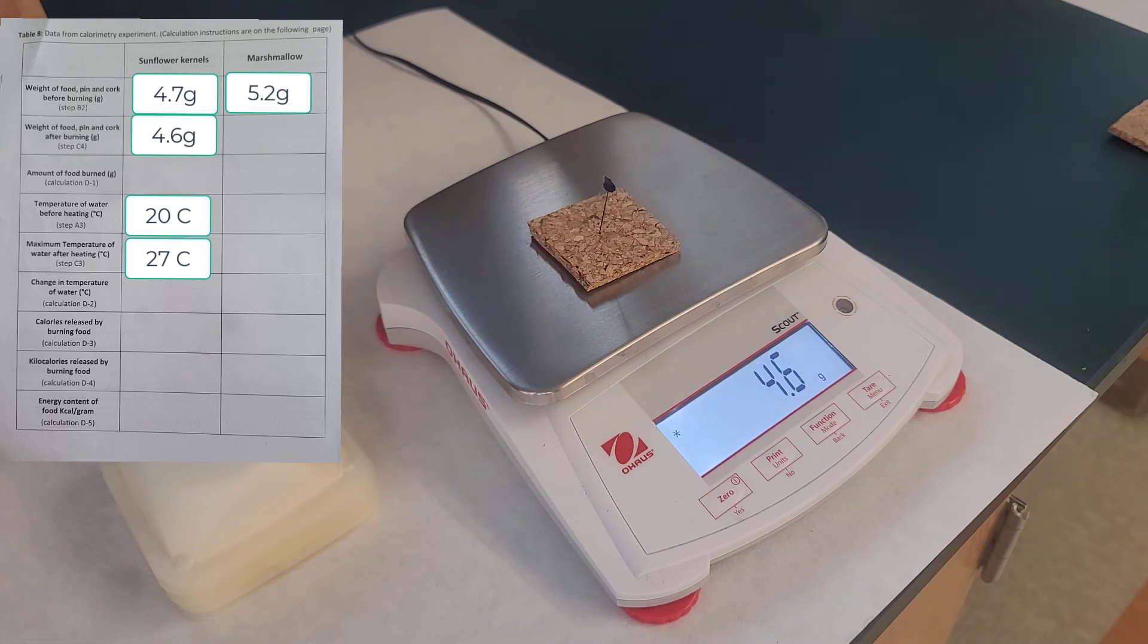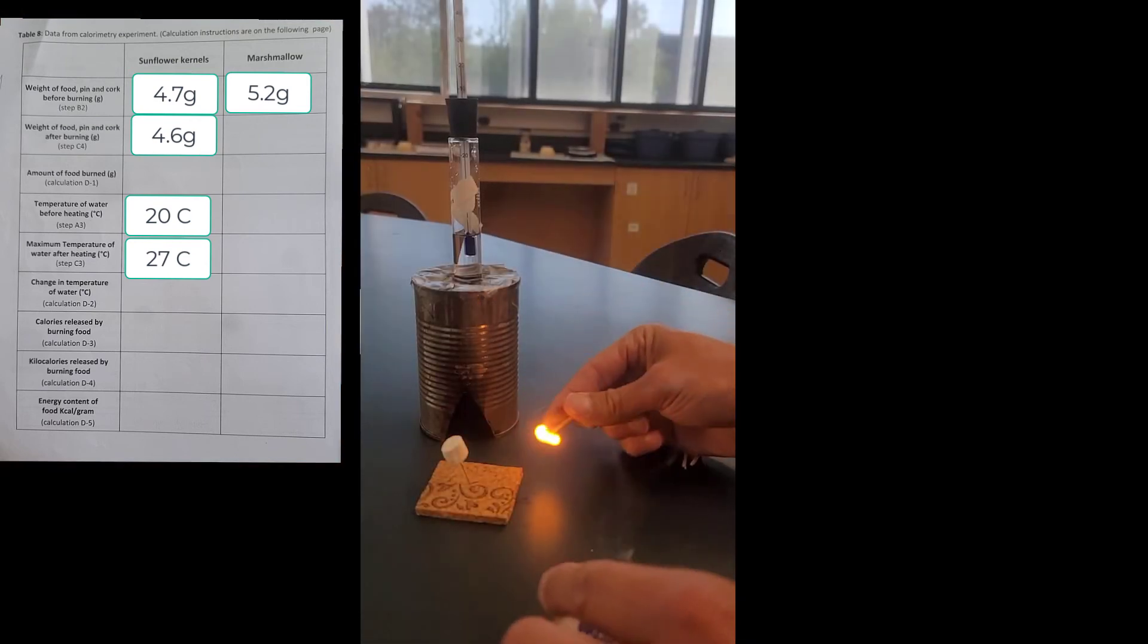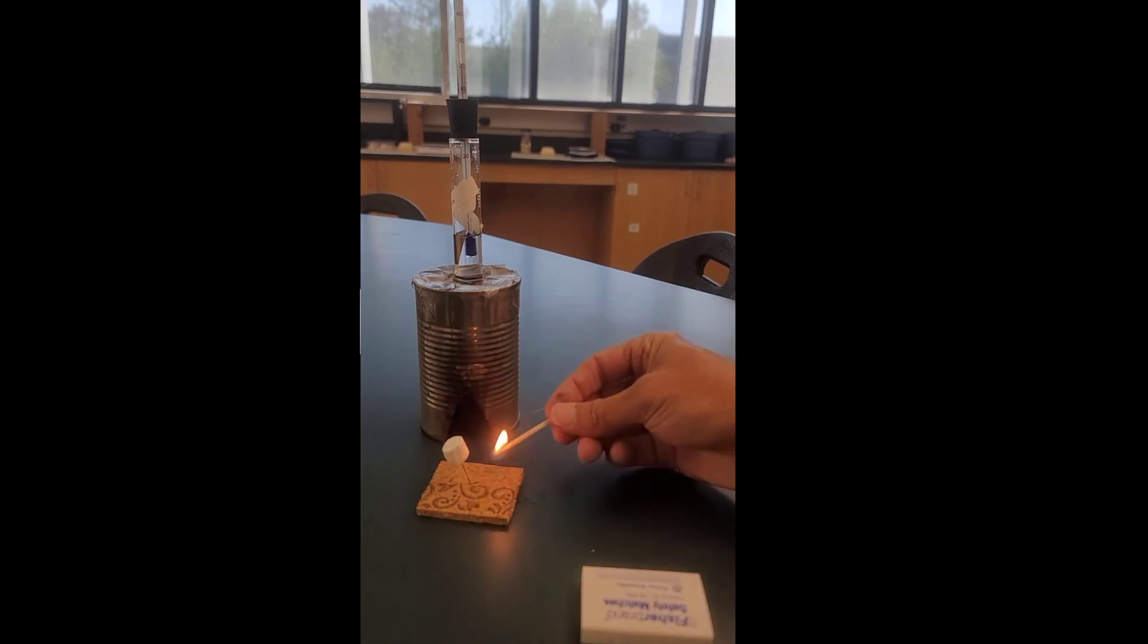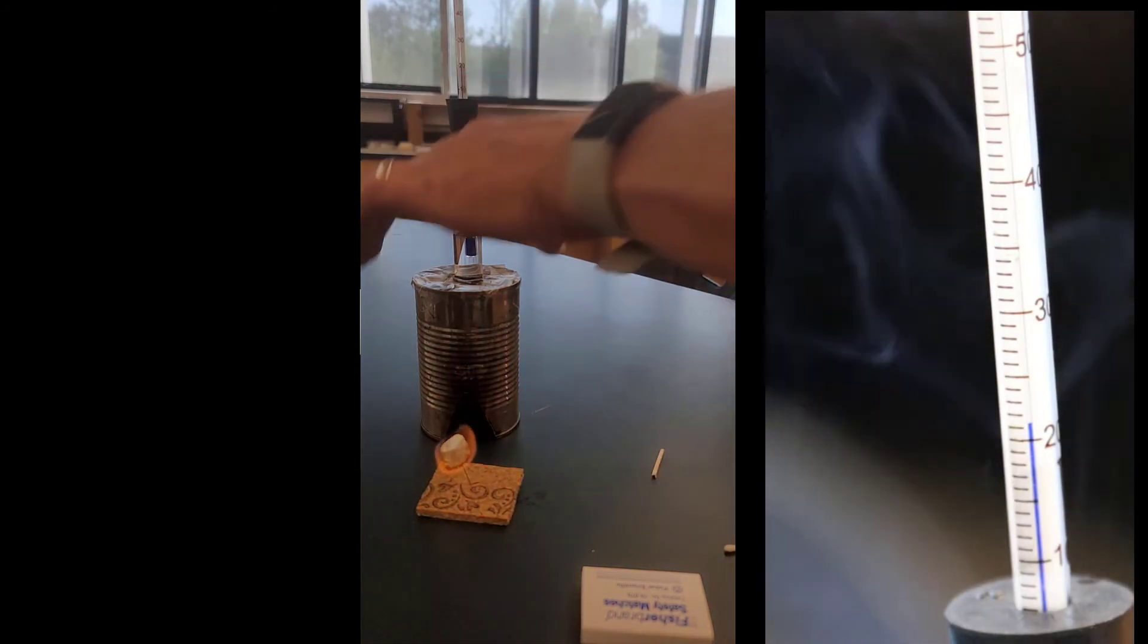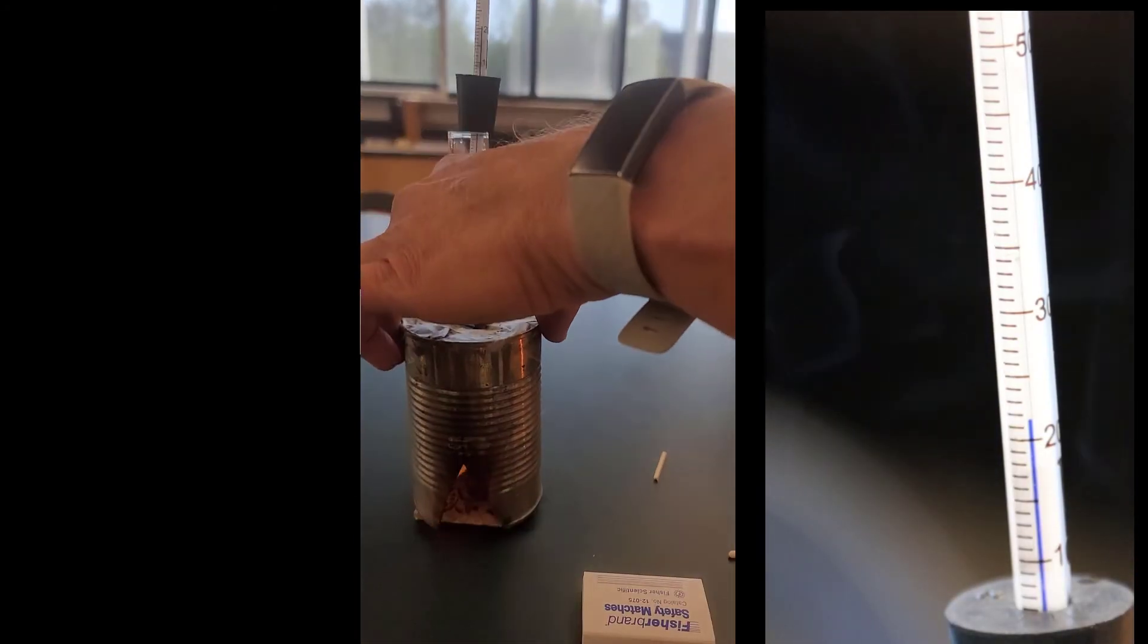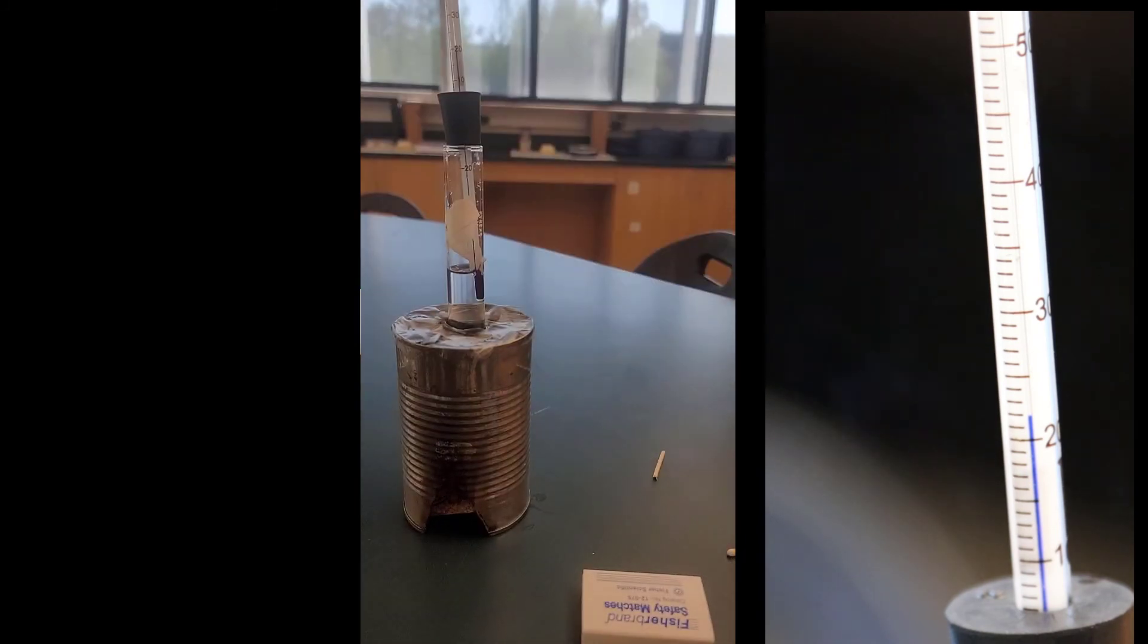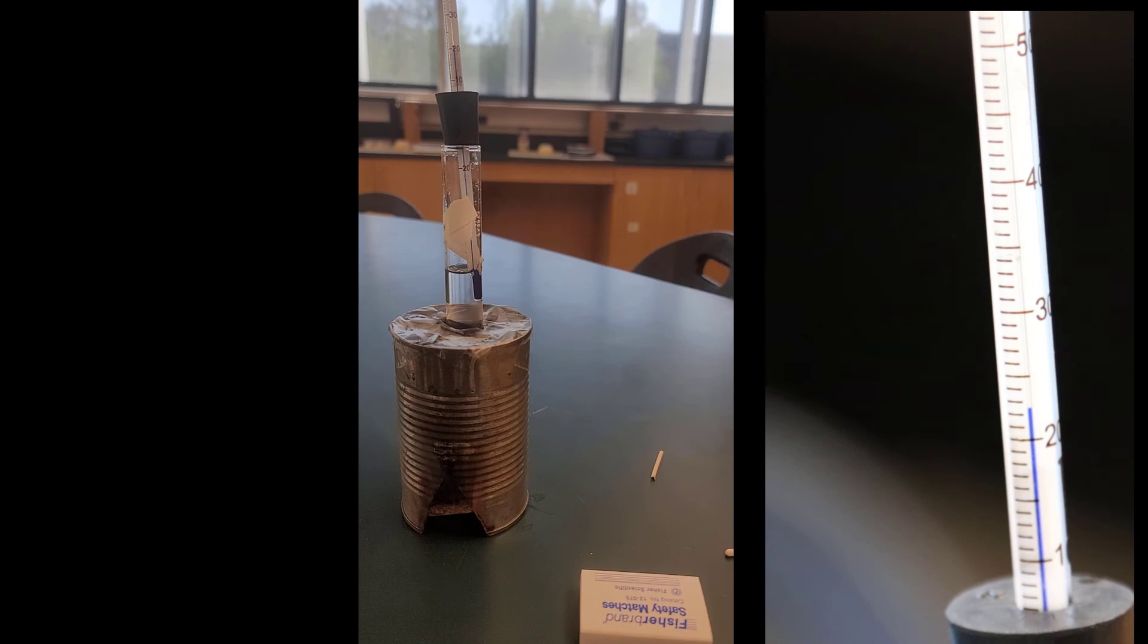We repeat the experiment using the marshmallow. What you're going to do now is take your marshmallow that's on your pin, set up your calorimeter, light your marshmallow on fire, get it burning, and then put the can on top. You do the same thing—record how high the temperature goes at the end of the experiment.